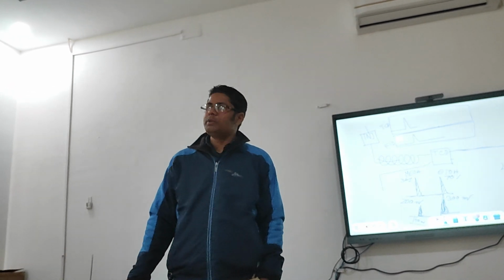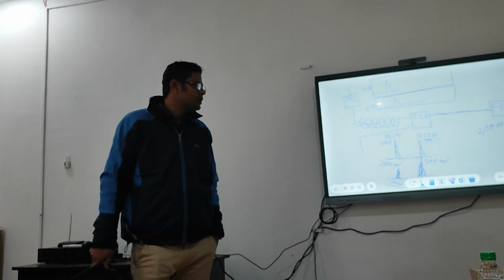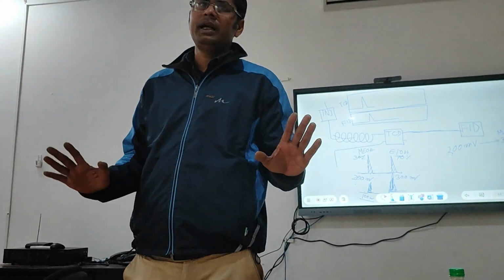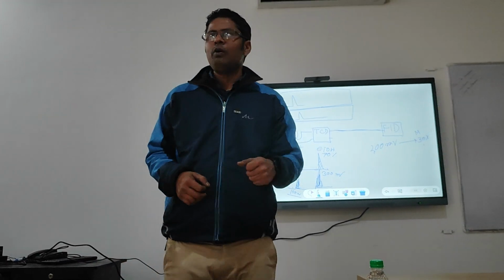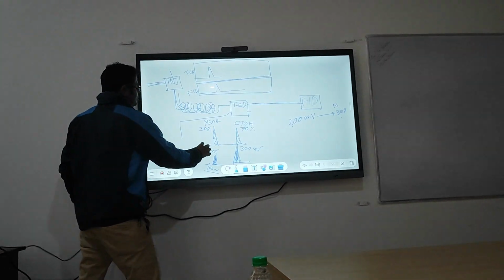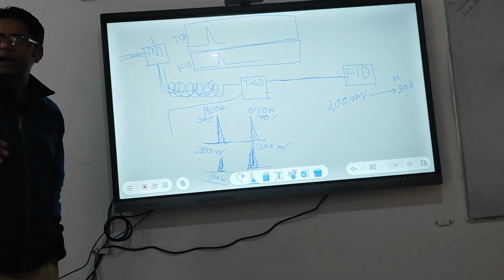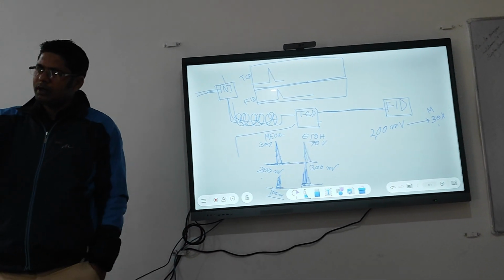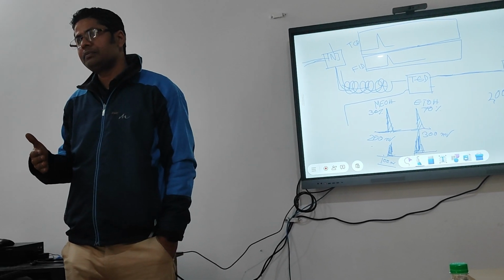Now the name of the component, the identification. How does it identify? How to get the concentration? You learned clearly, right? Nice. So the area is directly proportional to concentration. Now the name: every time your peak timing, the retention time, will not change. It will come at the same time every day. If you are injecting a very small amount, your peak will be very small, but it will not change its time.